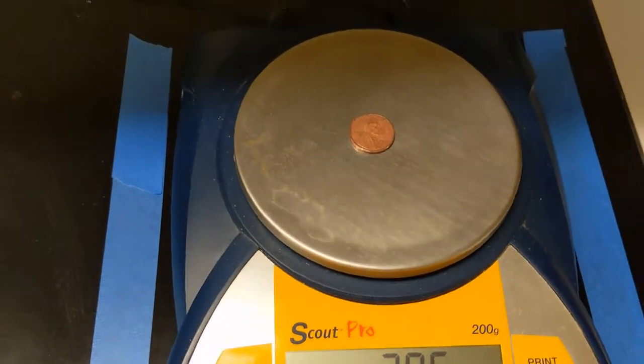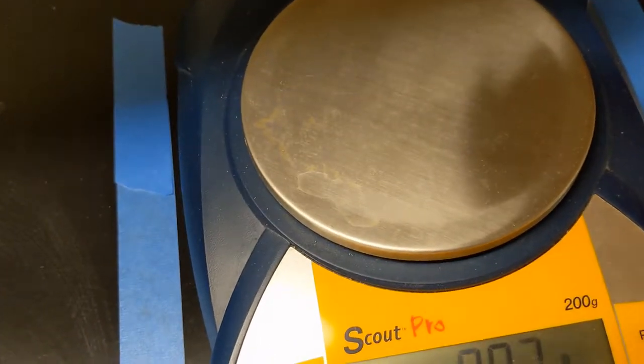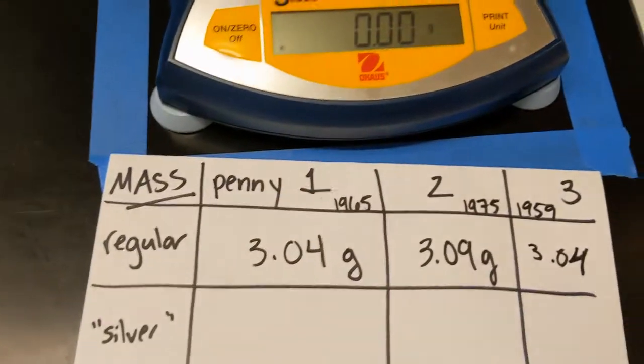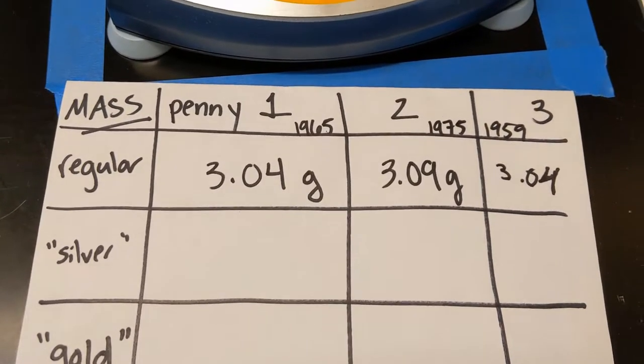So this is 3.04, and the year on this one is 1959. There we go, this is a 4. So make sure you take these measurements yourself, write them down, and we're gonna go ahead to the next part of our lab.